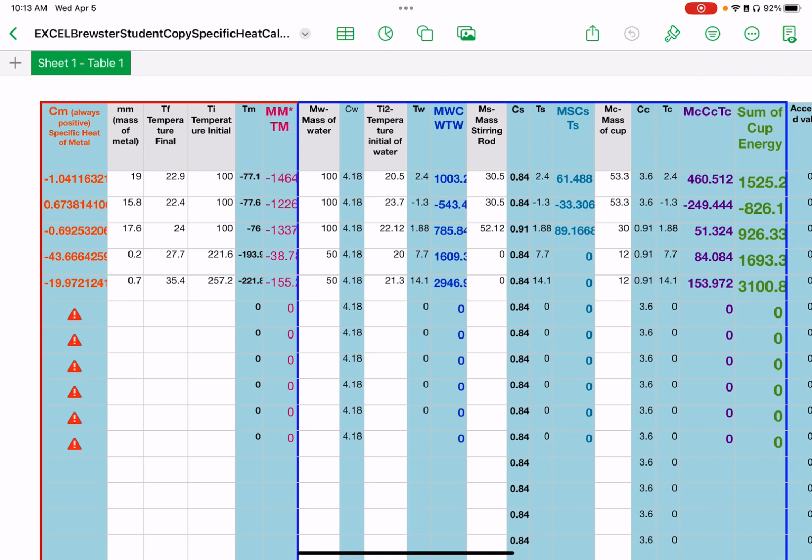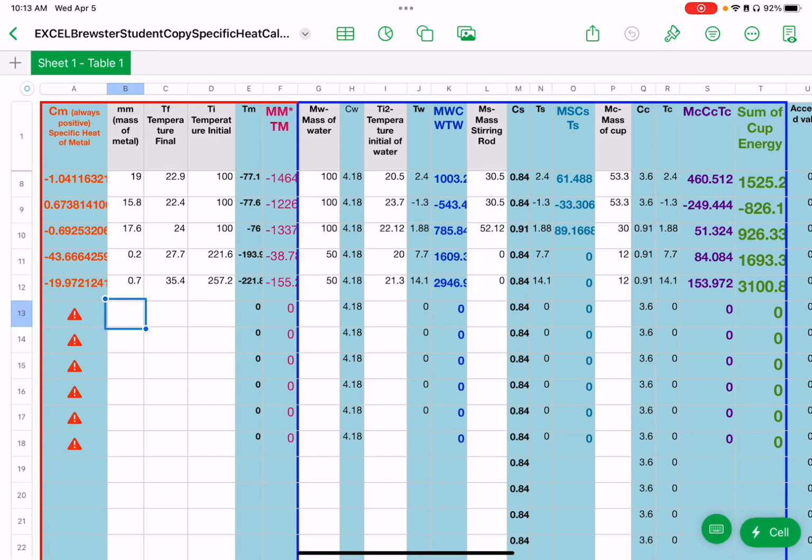And I'm taking some student data. And this group that I'm taking the data from, they've already taken the difference of the before they burnt it and the after. So we have to have the mass difference. We got to know how much of that substance you burned. So most of you wrote down what it weighed before, you wrote down what it weighed after, you take the difference. And we're going to put the difference right here.